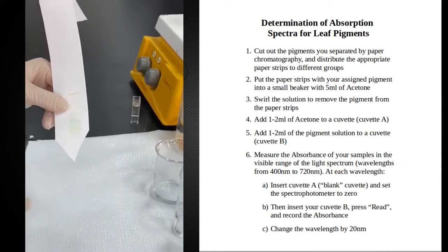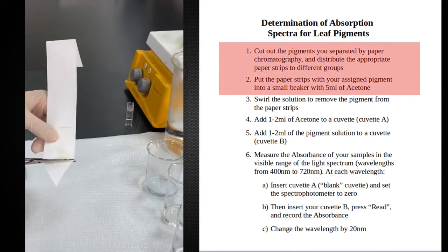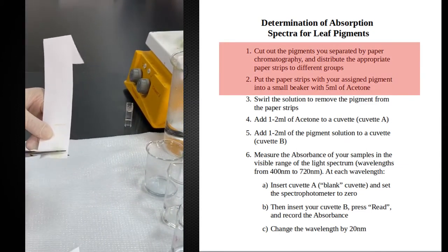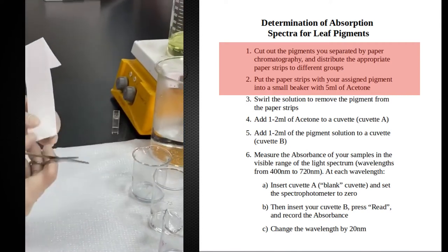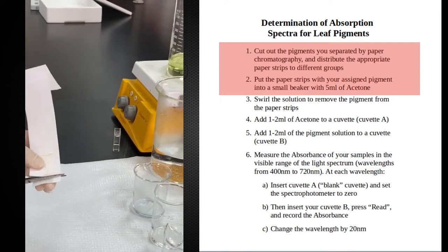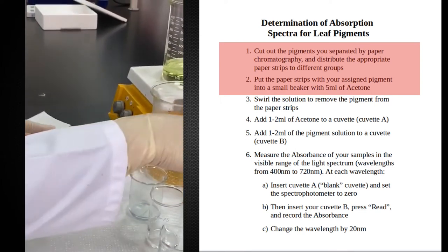What I have to do now is separate those different pigments from each other and re-suspend them in acetone. So this is chlorophyll A. I'm putting them in beakers. Each of those beakers contains 5 ml acetone.